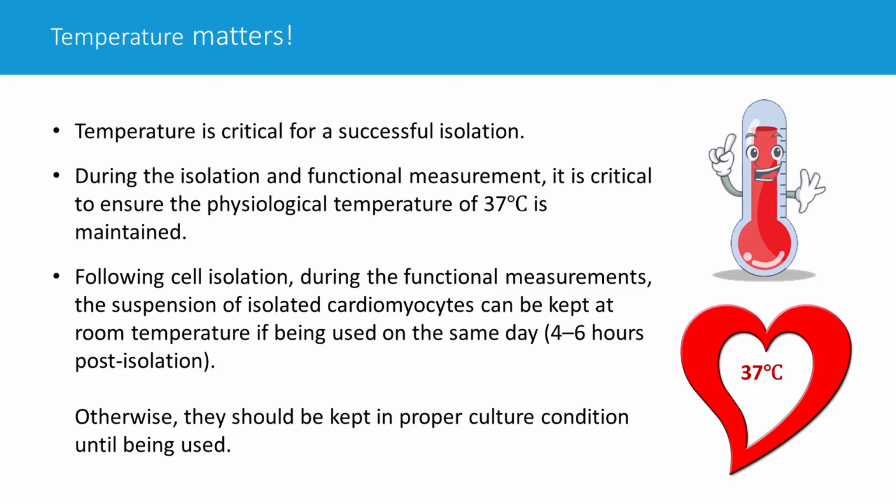But again, I agree with you, we can use other temperatures, because typically if they have a next batch, or maybe it's already in culture, they will take it out when they keep it at 37 degrees. But one thing we never do is put it on ice, because we try not to have too much temperature change, since you're going to perfuse them at 37 degrees. So we just thought to keep them at room temperature and it worked. But again, going to 0 degrees, you may actually slow down the metabolism or shut it down. That may actually maintain the cell better when you perfuse 37 degree buffer to wake them up. Again, it's trial and error, and you learn from your own mistakes or experience, I guess.